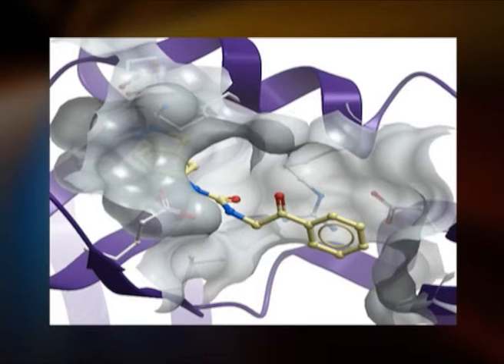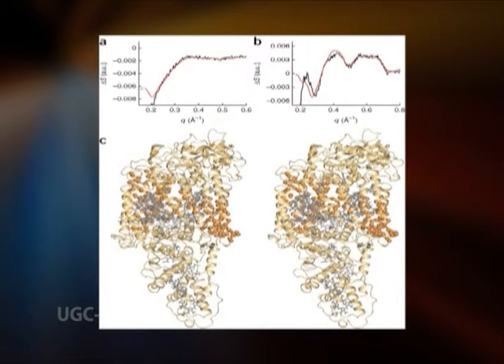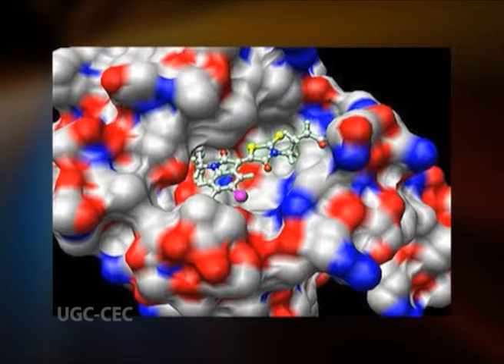It can also determine whether protein-protein or protein-ligand interactions alter the conformation of protein. If there are any conformational changes, this will result in spectrum which will differ from the sum of individual components. Small conformational changes have been seen, for example, upon formation of several different receptor-ligand complexes.